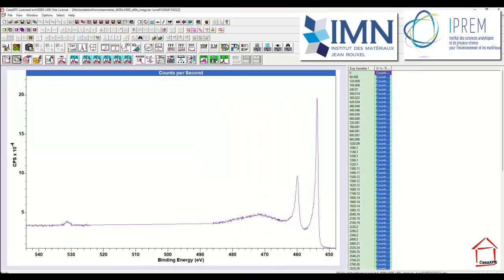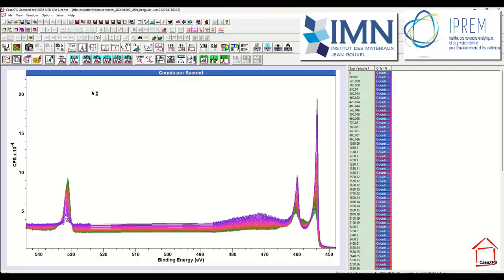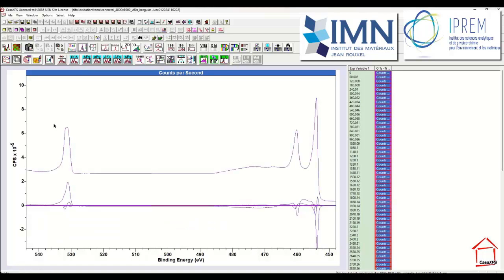So I've now got all of the data organized in VAMAS blocks containing oxygen and titanium for each of these experimental variables, so we can now process these data and see what shapes emerge from the spectra themselves, rather than guessing at what we think ought to be there. We can find out how many different shapes we might expect to see in these data if we simply apply PCA to these data. And then the abstract factors that are calculated are an indication of the signal that's required to reproduce the entire data set.